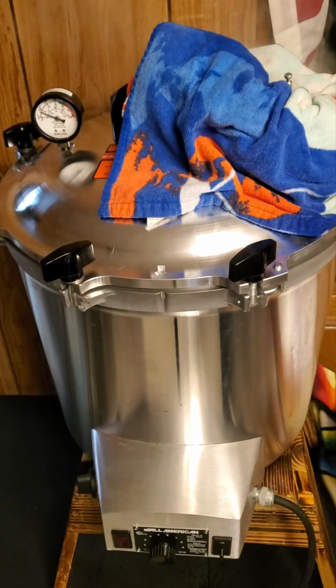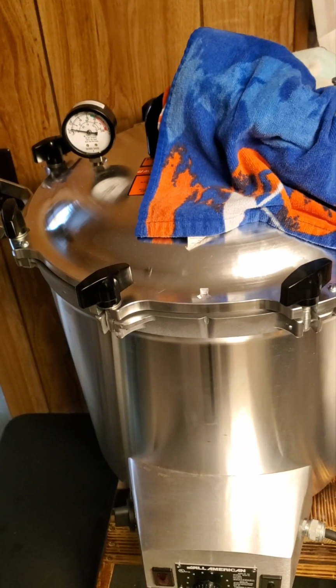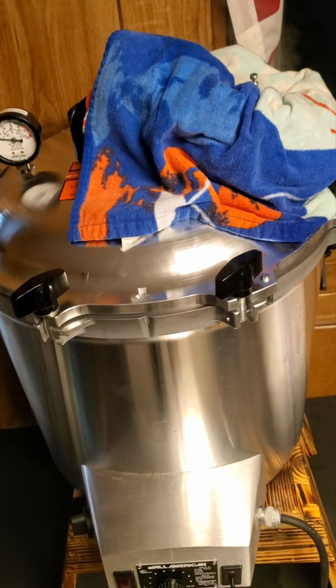Room is full of steam, and I was about to say the alarm is going to go off. Quite a bit of steam. Probably because it's the first time running 9 bags with it. I'm almost down to zero now.